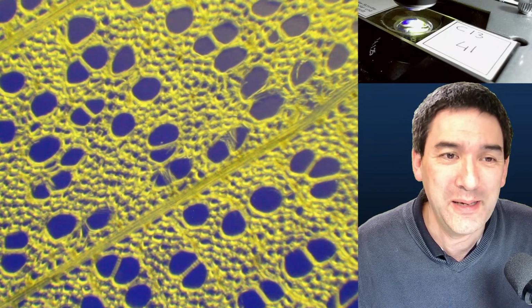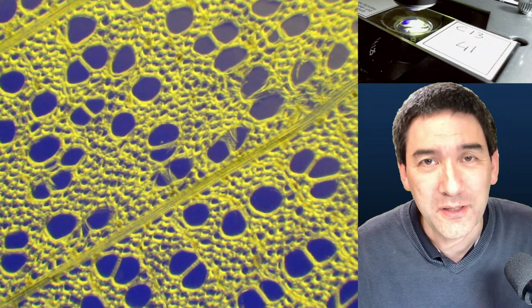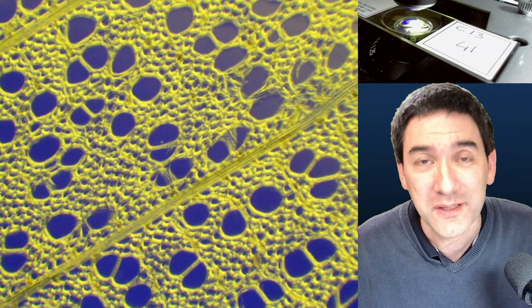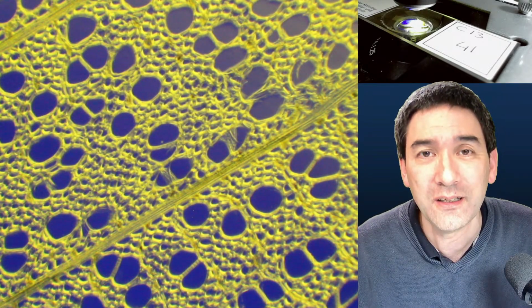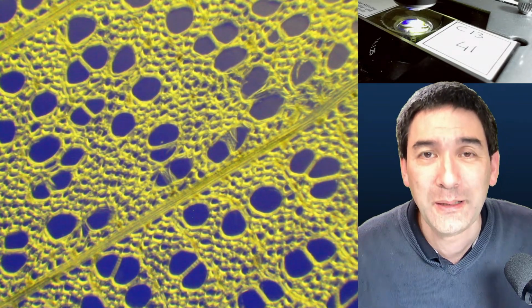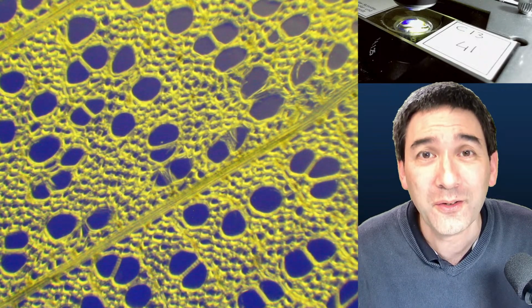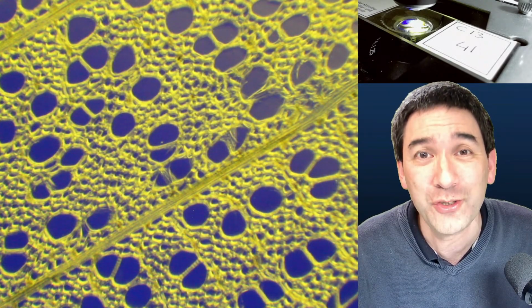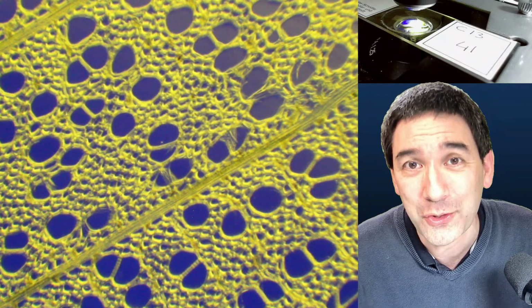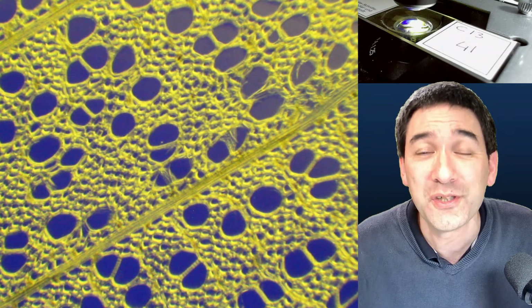Let's put it this way. The LED does have the advantage that it does not produce as much heat. So that's certainly a significant advantage. And if you do photography through the microscope, then by changing the light intensity of the LED, you do not change the color temperature. But halogen generally produces more heat, and also produces a more reddish color.